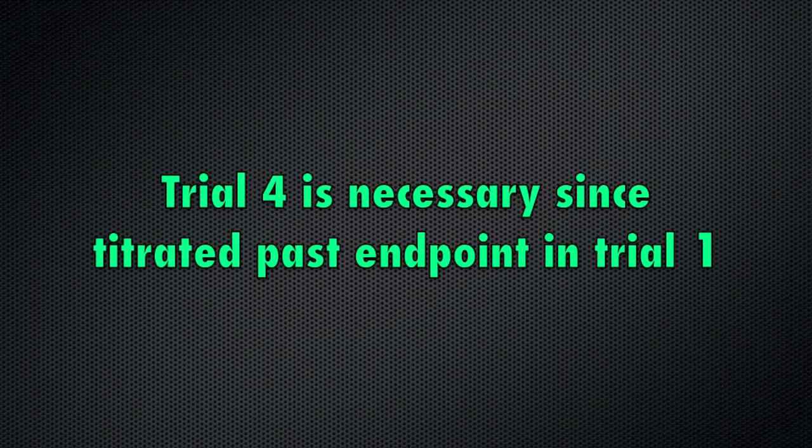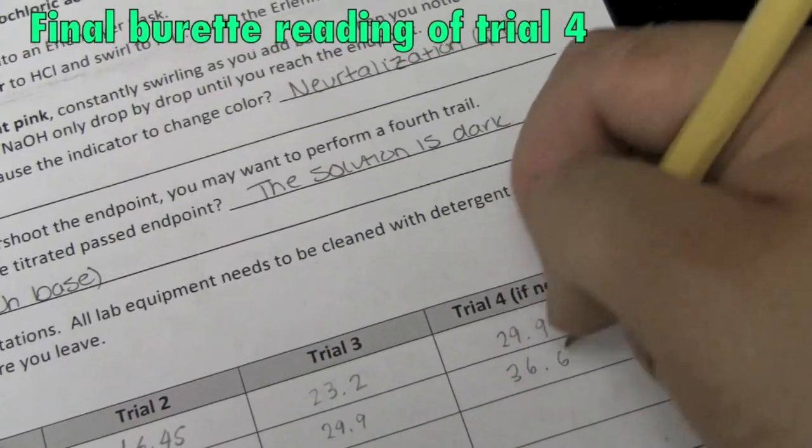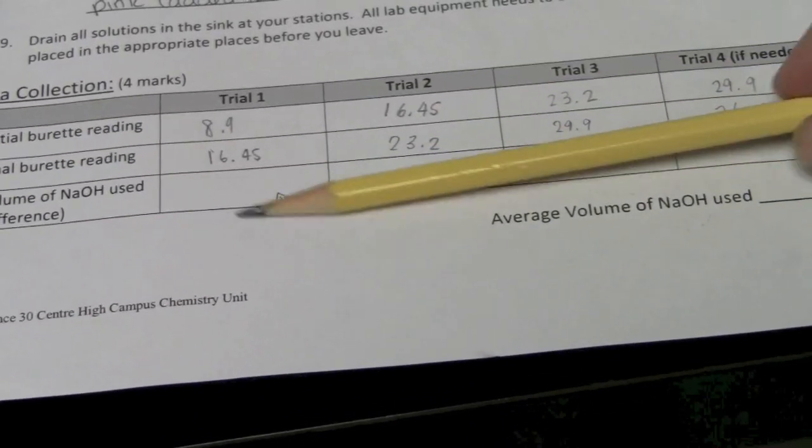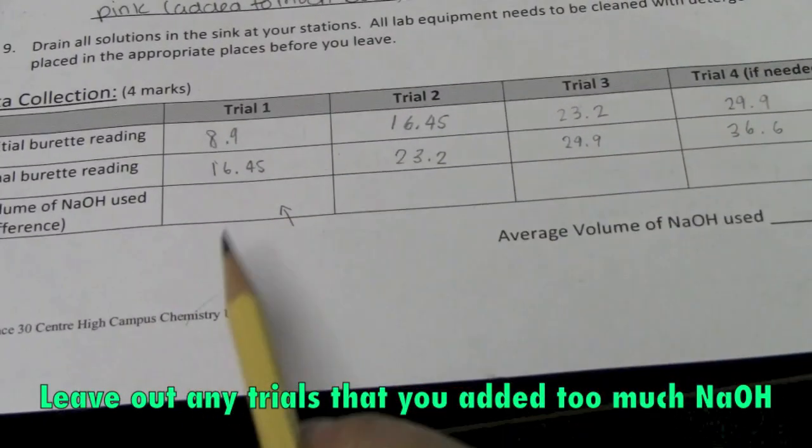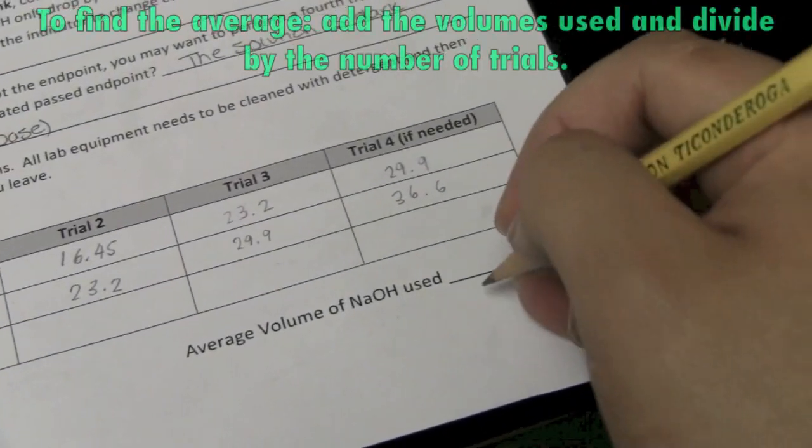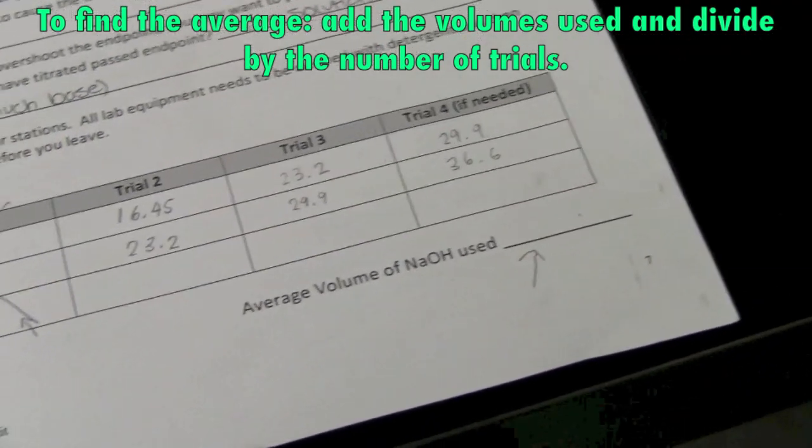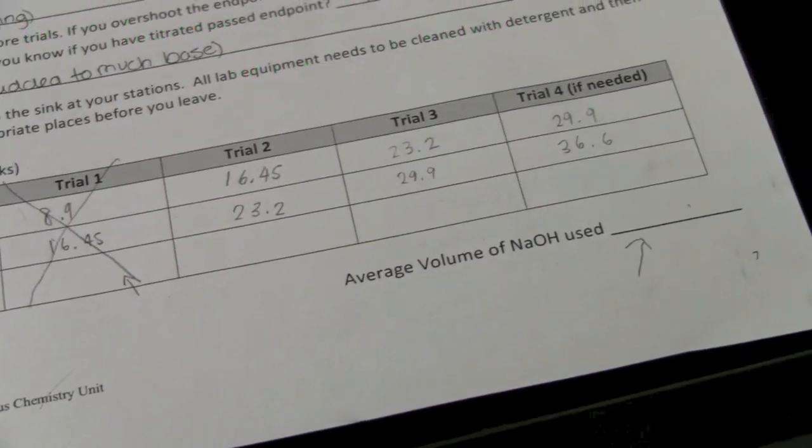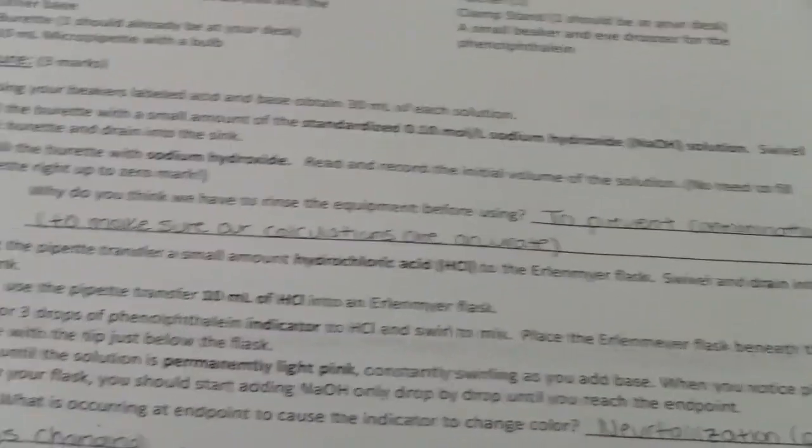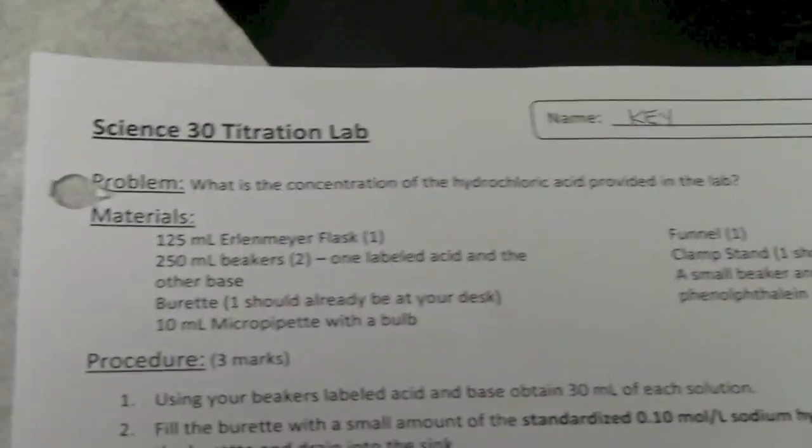So all you have to do is you're going to use this. And of course, because we overshot this one, we're not going to use that as a trial. You're going to calculate the average volume of sodium hydroxide used and you're ready to calculate for the concentration of hydrochloric acid, which is the problem of this lab.